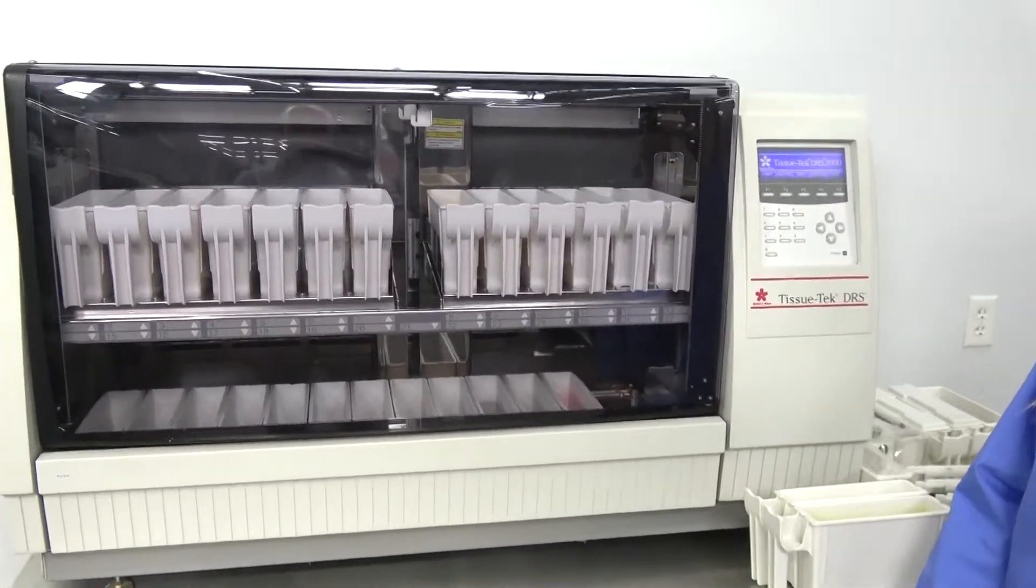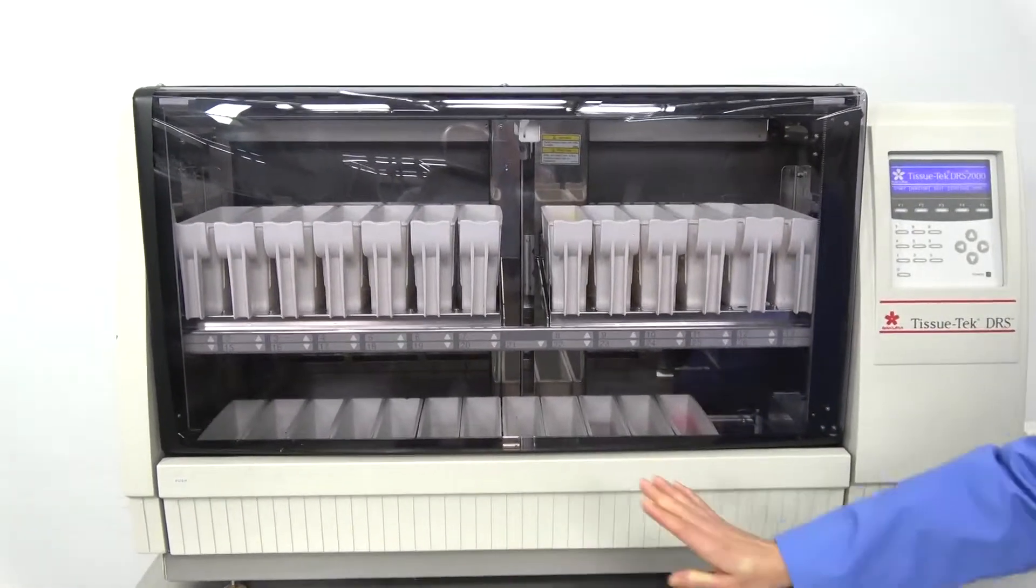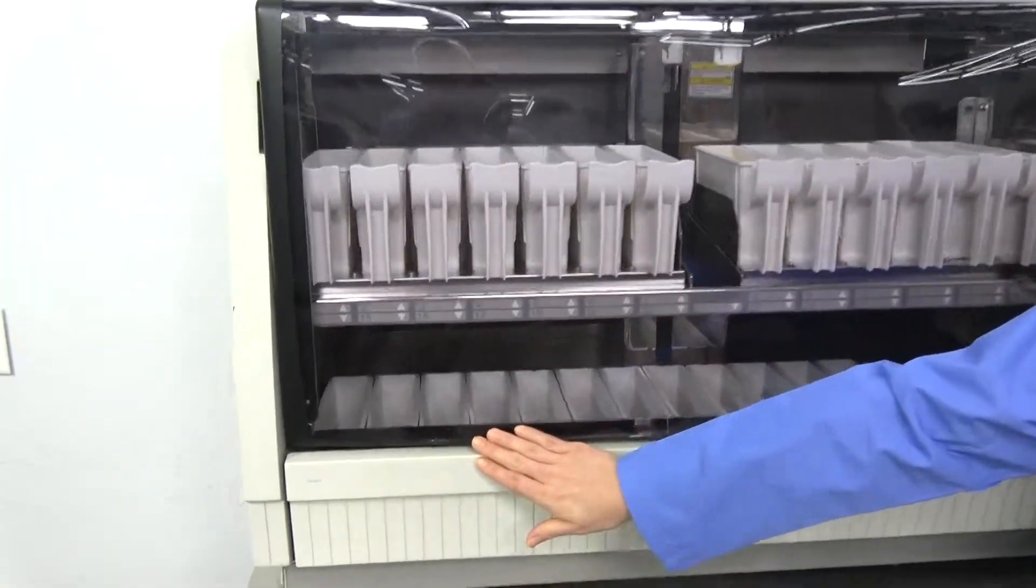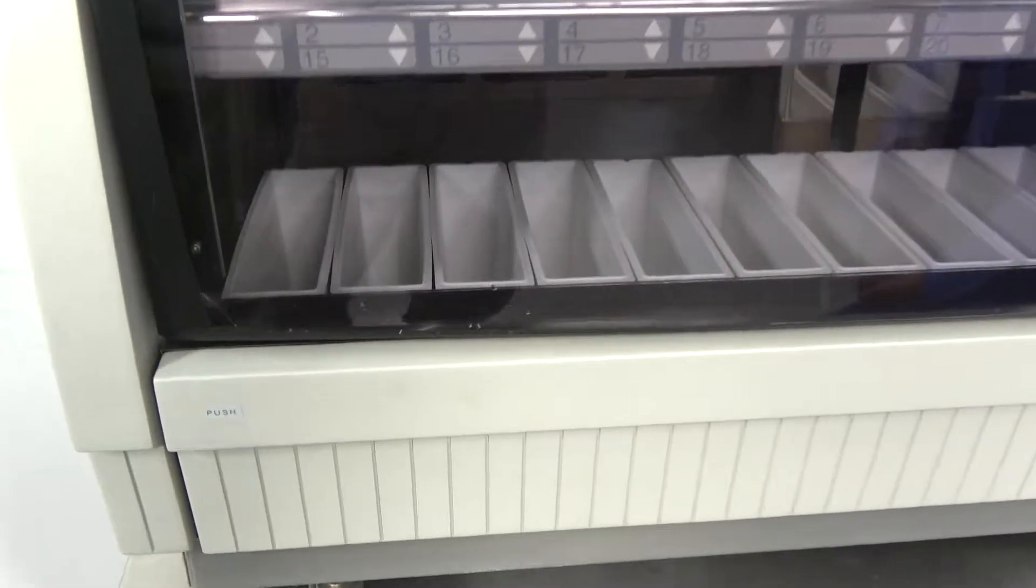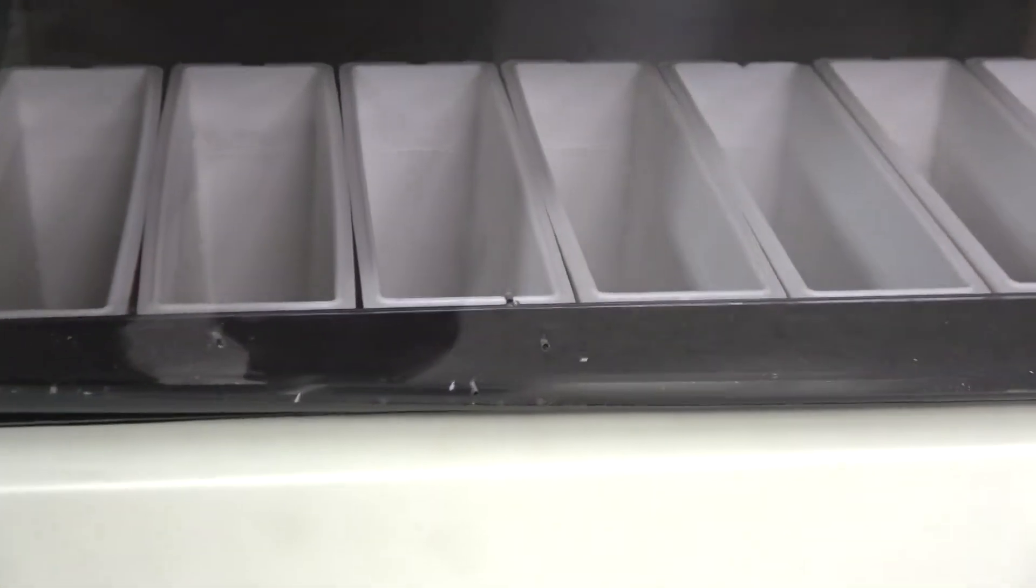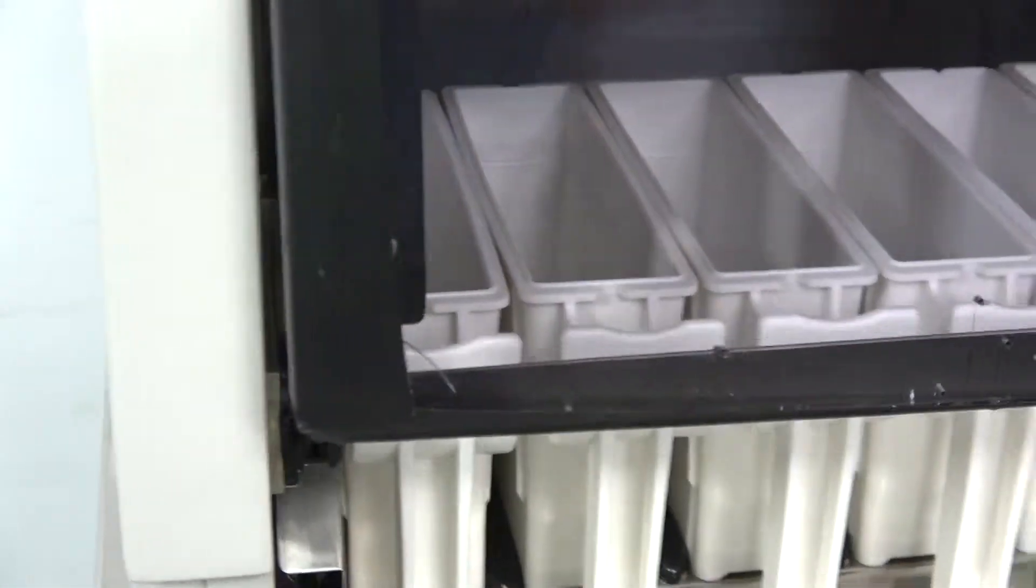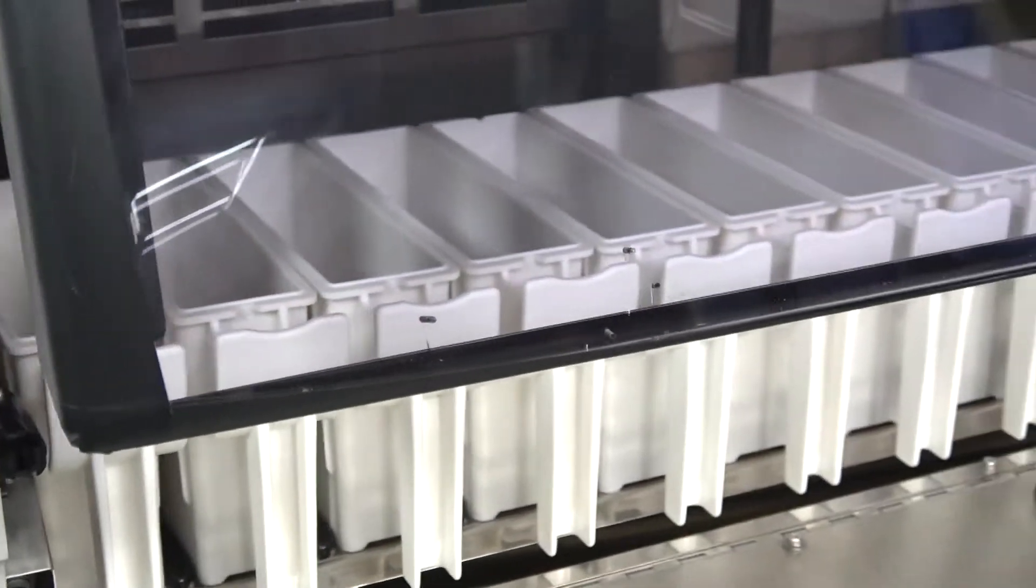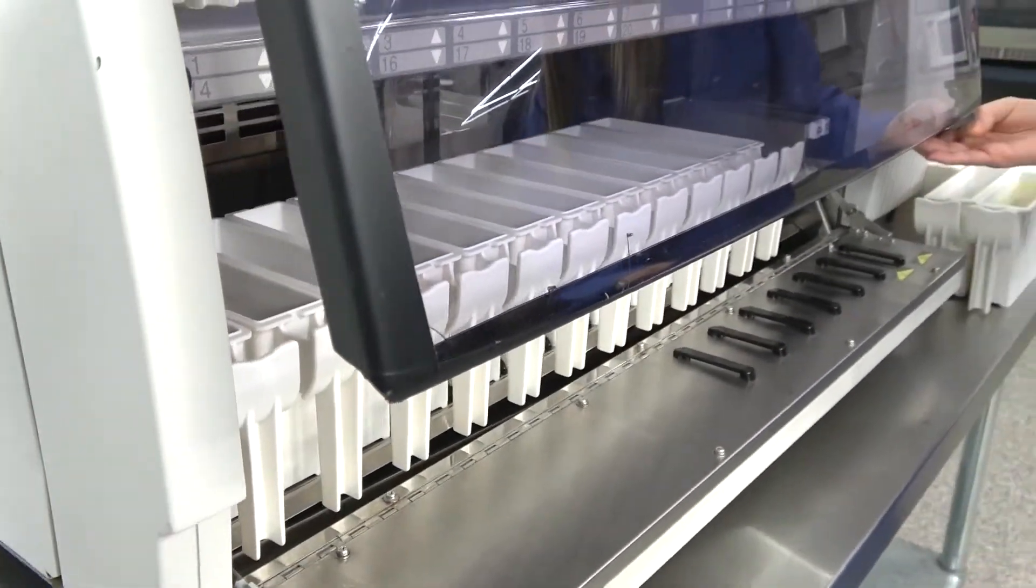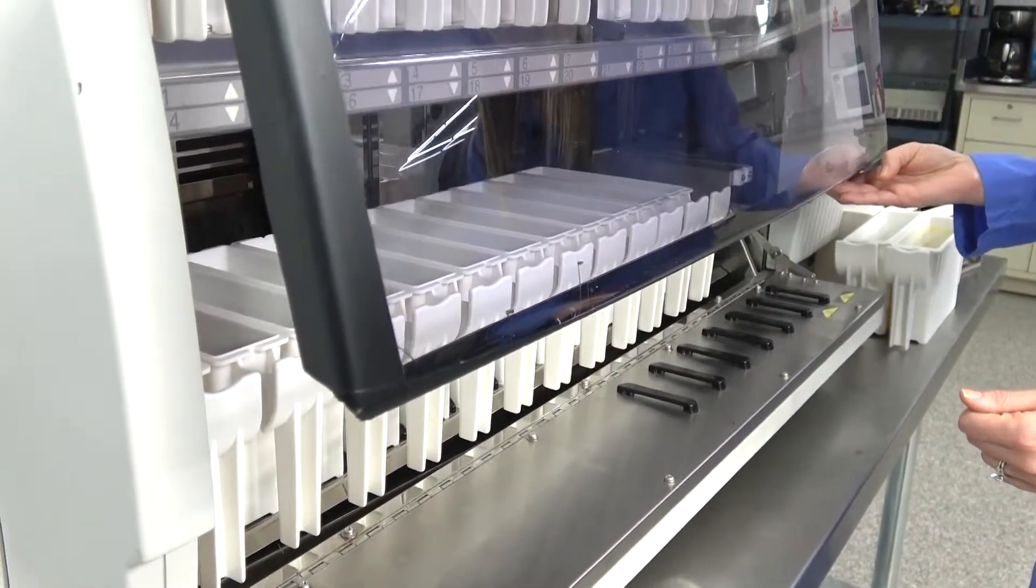There are a few cosmetic scratches and cracks that we have addressed. You can see them located here at the bottom. Now these have been stabilized and we have also used tape to help further stabilize them on the bottom here and on the side so the cracks aren't going to elongate any.